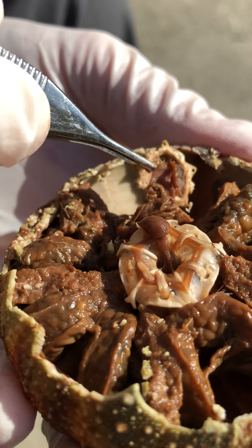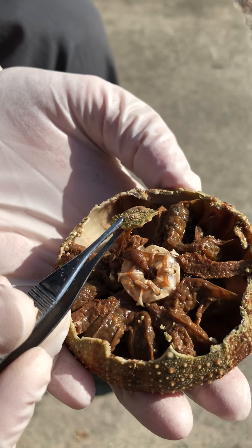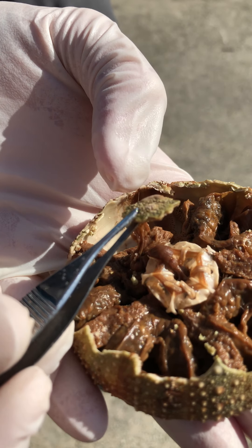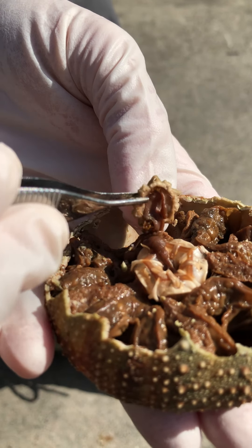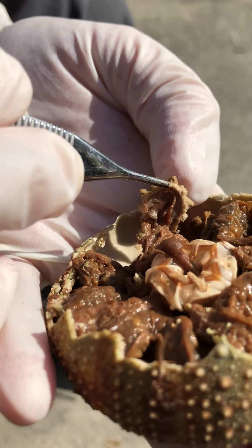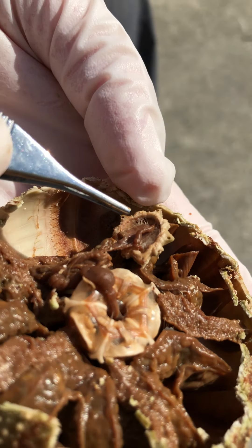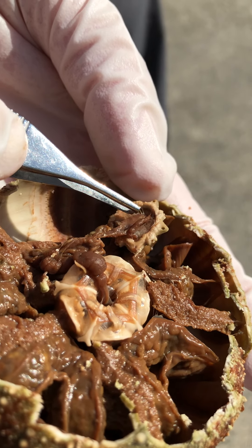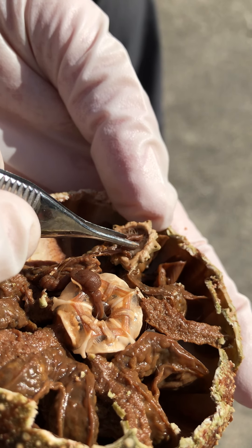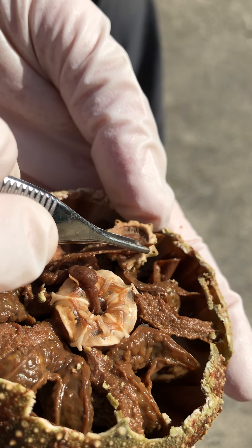Now I'm going to take that aboral bit of integument and lift that up, and you can see there are some tubes attached to that. One's still attached. This little tube right here was actually attached on the inner side of the madriporite, and it came undone. So I'm just going to draw that back and make it possible to see underneath there.